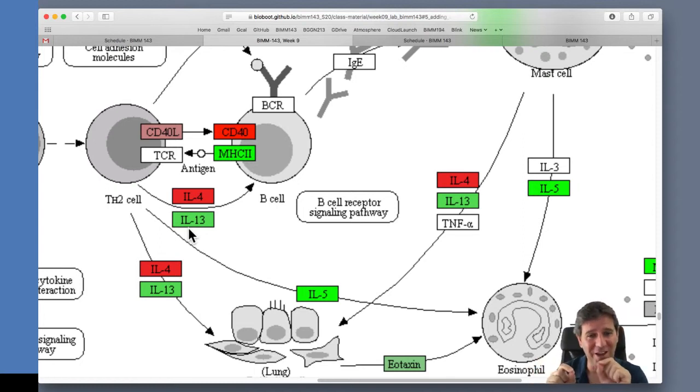But before we do that, we've got this big data set of genes, and we've looked at fold change, so we've made it smaller based on those that change a lot. And we've also got the statistical significance, the p-value of that difference between samples. But it's still a big data set. So let's see how big it is and try to do a summary figure before we go to this pathway analysis. And we'll just finish off briefly with this.